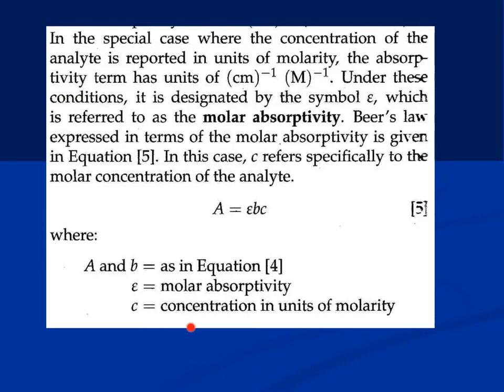Correspondingly, the concentration of the solution should be represented in molarity, not in percentage or anything else. So if you are measuring absorbance using absolute value, then we should be using concentration in molarity. Those are some of the things we need to be careful about.